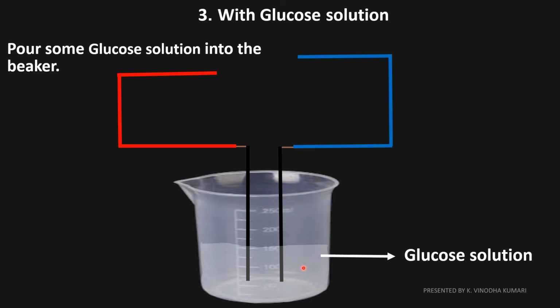So the HCl and H2SO4 have the H plus ion in common. But the movement of the positive and negative ions in the solution helps the flow of the current. Now we'll see whether we are going to find any movement of the ions in the solution and whether we'll see the glow of the bulb or not.